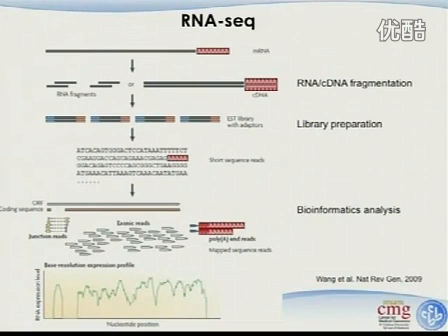There's a bunch of consecutive A's towards the end of the reads. Once you find it, you remove it but make a mark, and then align the rest of the reads. That helps you define the end of the gene, which is a really nice feature. We don't do that in our lab regularly yet. Hopefully we'll do that in the future. So everybody got what he was asking, right?